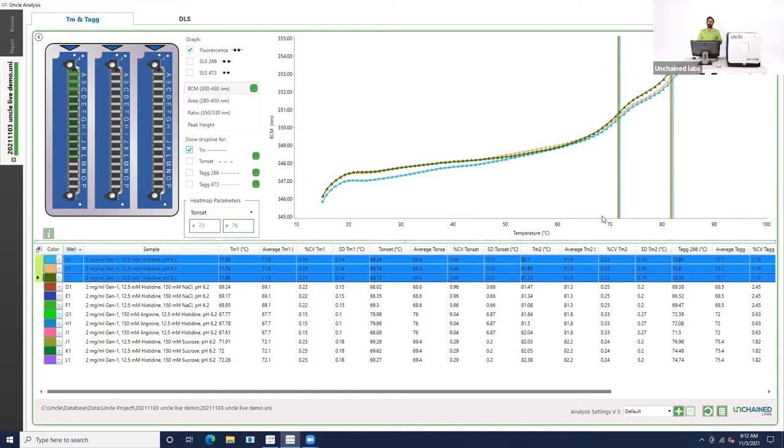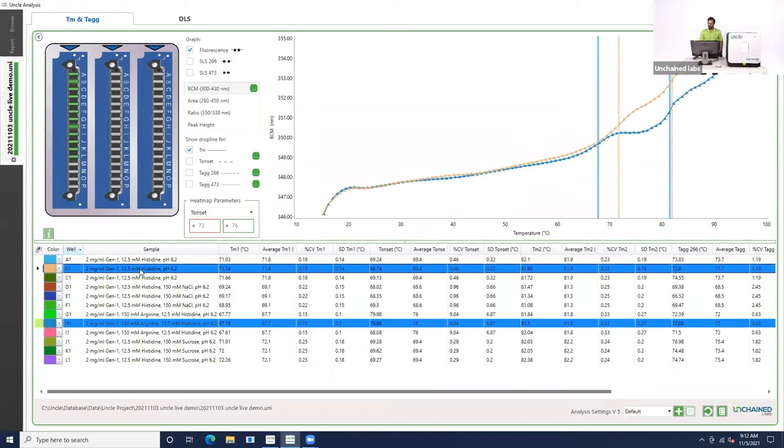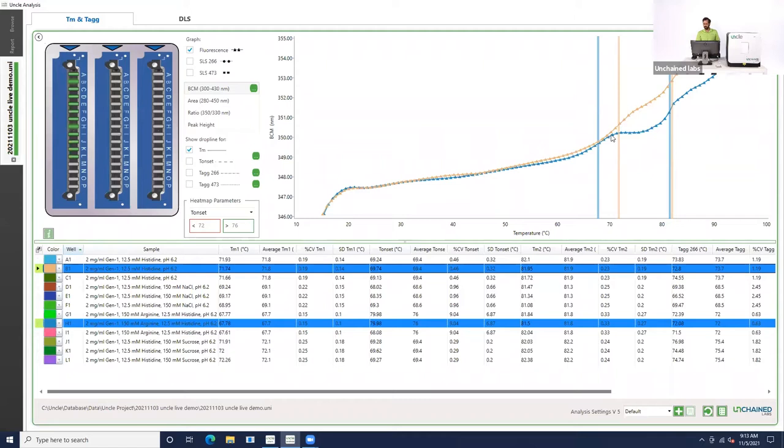Since we're trying to rank the thermal stability of this antibody in different buffers, let's compare the histidine sample to what happens when we add arginine. You can see that when we added arginine to the buffer, TM1 shifted from 72 degrees down to about 68 degrees — so this monoclonal antibody in arginine is slightly less stable than it was in just the histidine buffer. What's also interesting is that even though TM1 shifted by about 4 degrees Celsius, TM2 didn't shift very much at all when we added this excipient, which is kind of an interesting phenomenon.